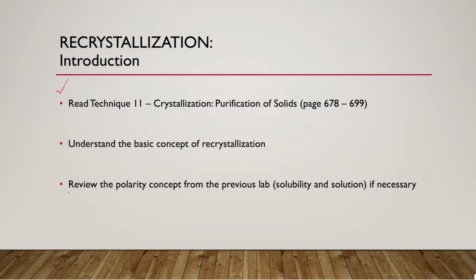By understanding the polarity concept, it will greatly help you to understand this recrystallization concept as well. So make sure to read the book and try to understand. Then come back to this lecture video and watch the rest of it.